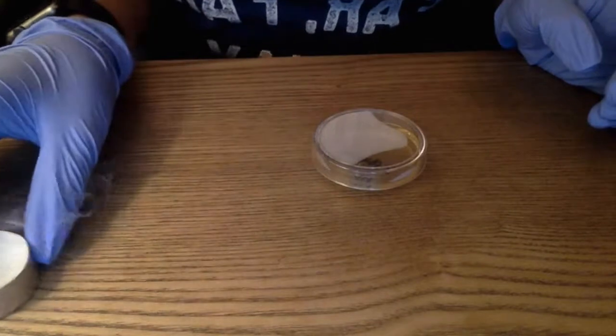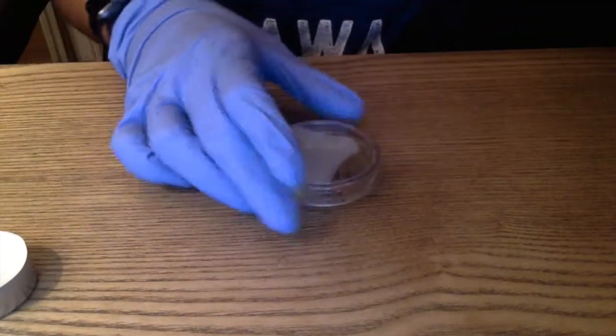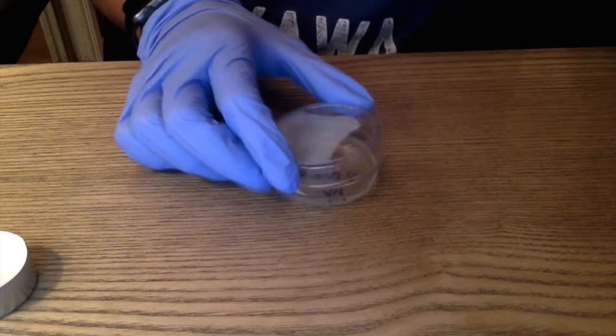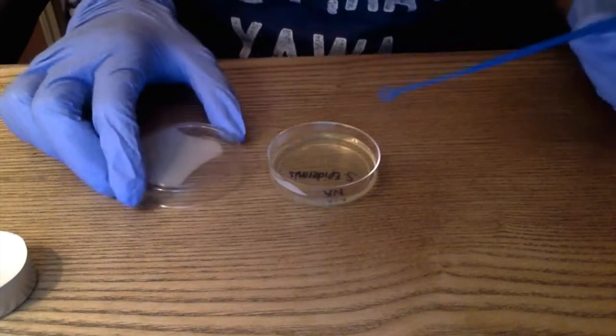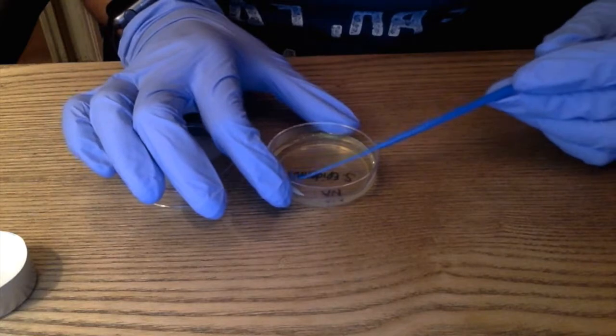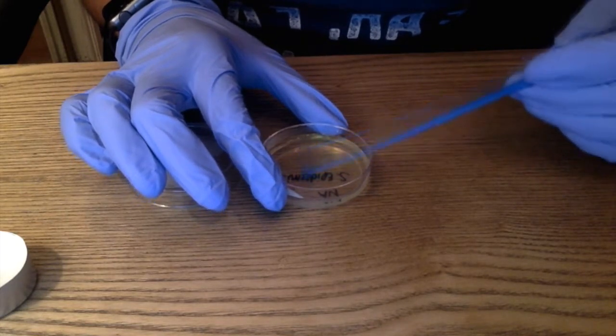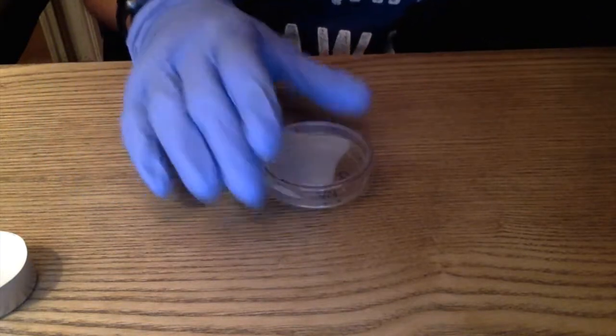Could put that out, we don't need that anymore. Alright, and now I'll go ahead and take the inoculation loop again out of the alcohol, and we're going to move some of quadrant 1 to a zigzag formation into quadrant 2. Place the cap back on that.